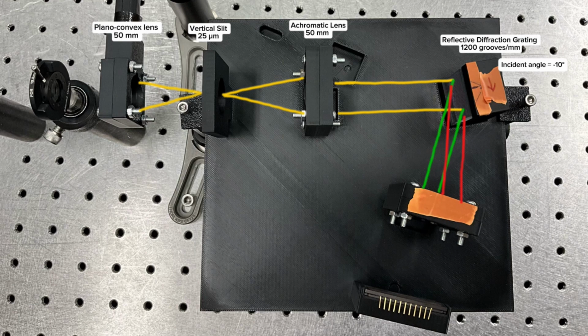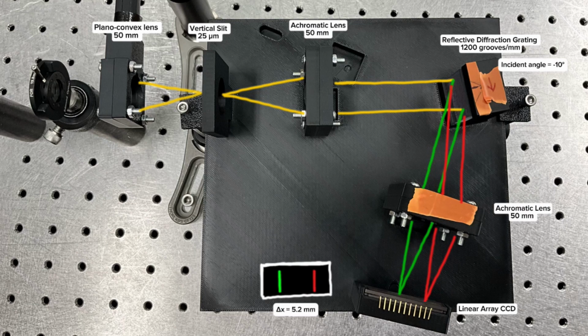This angular separation enables resolution of the individual wavelengths that correspond to the various vibrational modes of molecules within the fabric. The light dispersed from the grating is focused onto the linear array CCD sensor by another 50mm achromatic lens, which will form an image of the entrance slit onto the detector plane. This means that different wavelengths will appear at different positions along the linear array CCD, allowing us to detect the Raman spectrum from the sample.